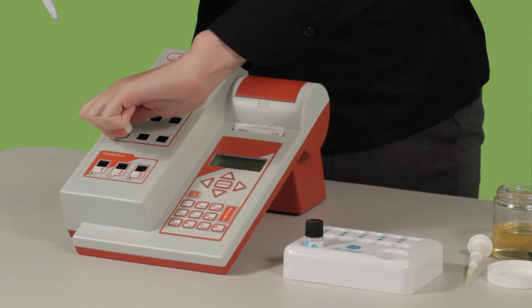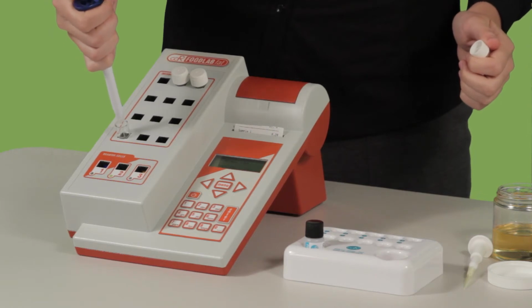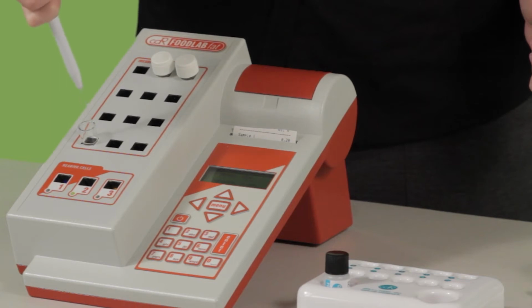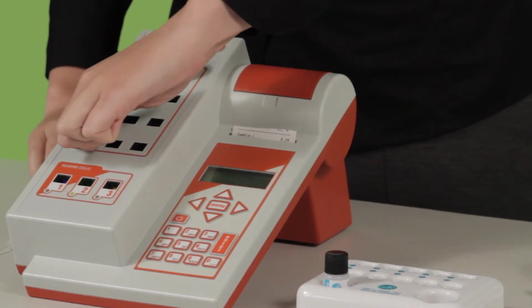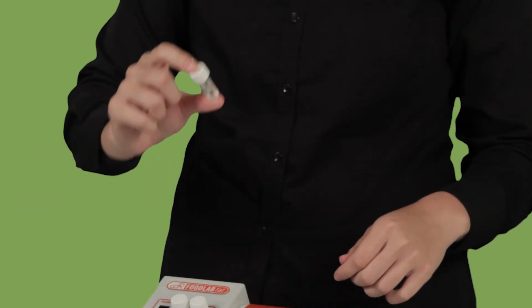You will now need to remove the cap, insert your pipette all the way into the reagent, and press up and down. This makes sure that all of your oil is cleaned out of the pipette. You will then want to tap off any excess reagent and replace your cap. Now, you need to invert your cuvette to make sure a homogeneous mixture is made.